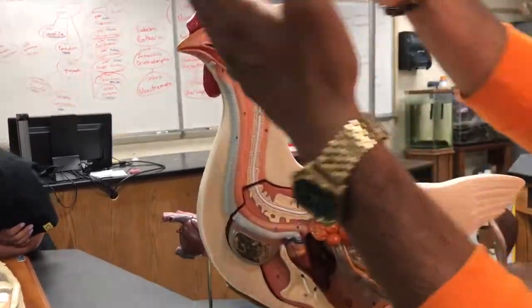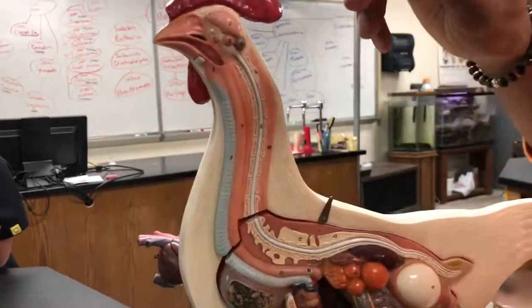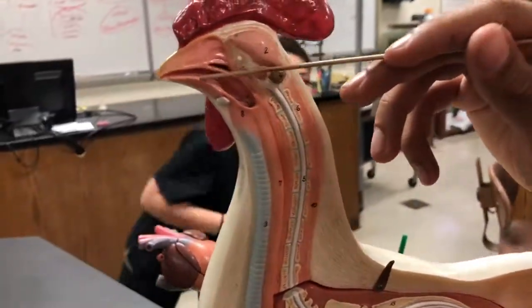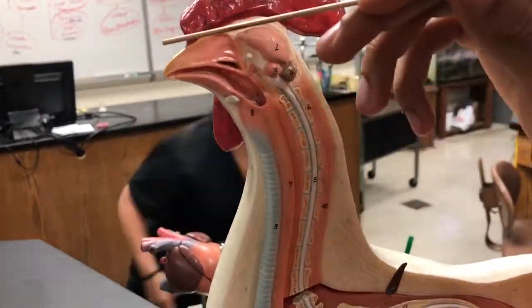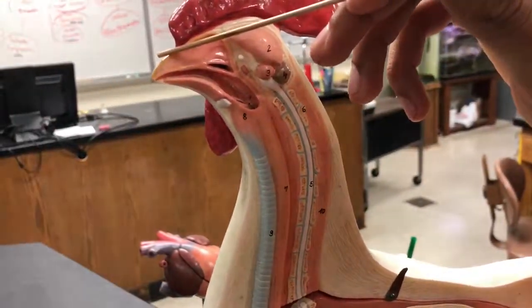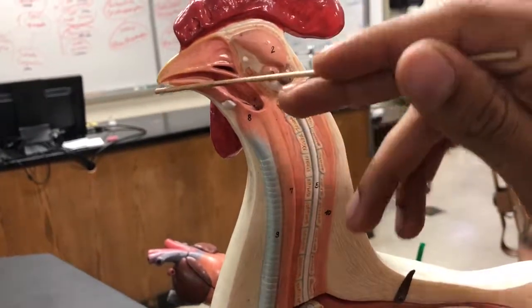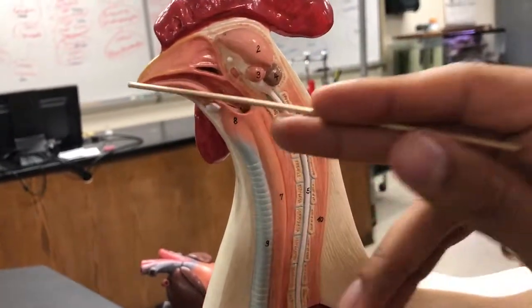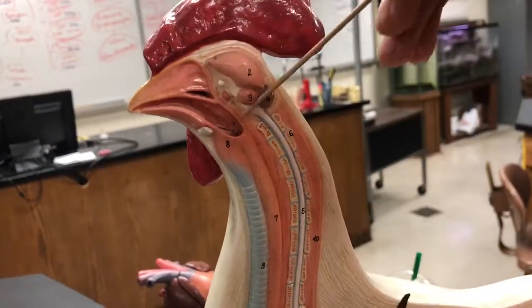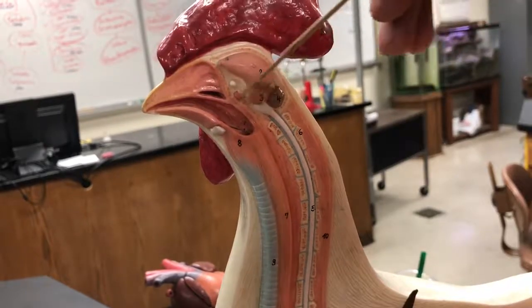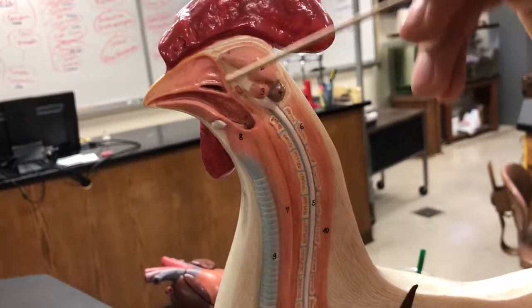As we look at the anterior side, right here this structure is called the tongue. On top we have the maxillary beak and on the bottom we have the mandibular beak, and this hole right here is the glottis in the region of the pharynx.